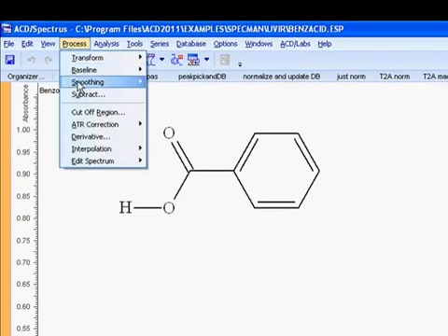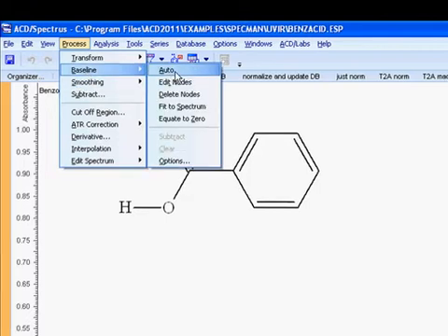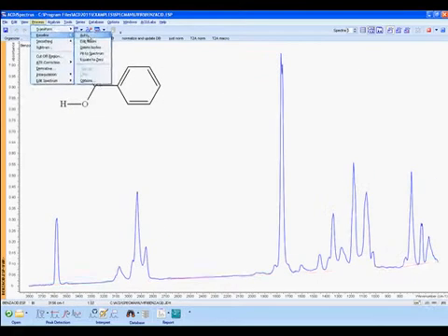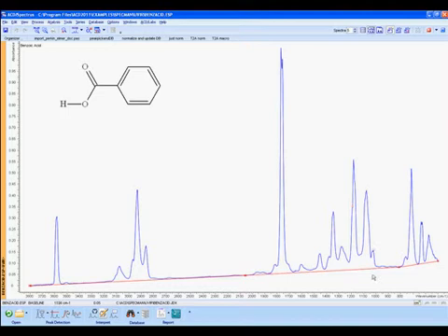To start, we will go to the Process menu and select Baseline Auto. This generates a baseline across the bottom of the spectrum, seen here in red, which is subject to the parameters set in the Baseline Options menu. One can make changes in the Options menu to change the characteristics of the baseline.